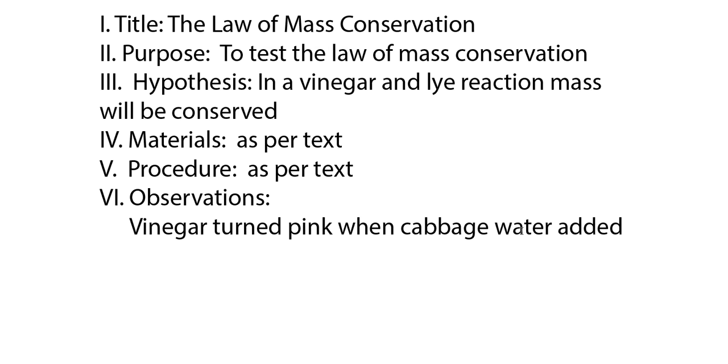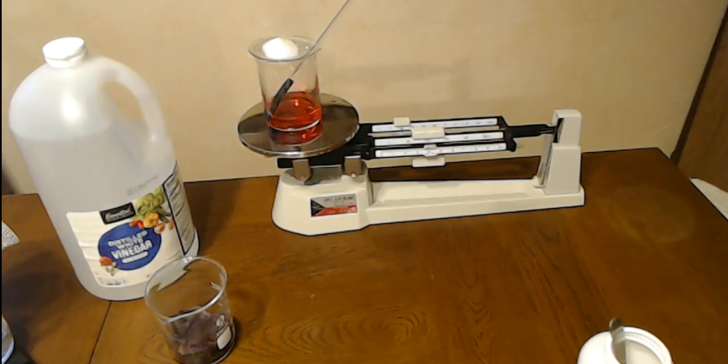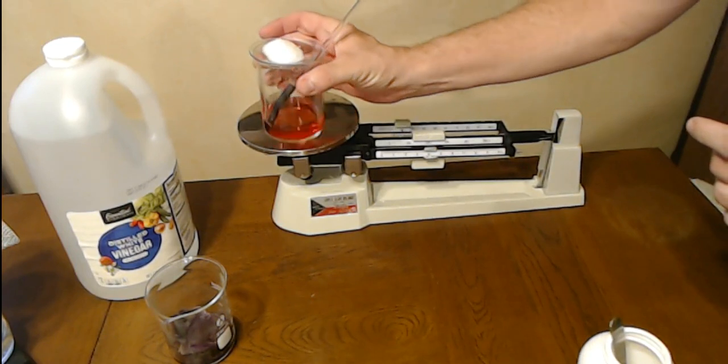Oops. And I'm going to write beginning mass 224.2 grams. In chemistry, make sure we have those units so you know what you're working with. So, okay, now we're going to do our reaction. Let's flip back to our screen here. Okay, so we got our apparatus.